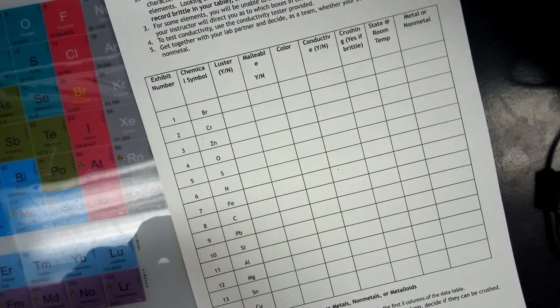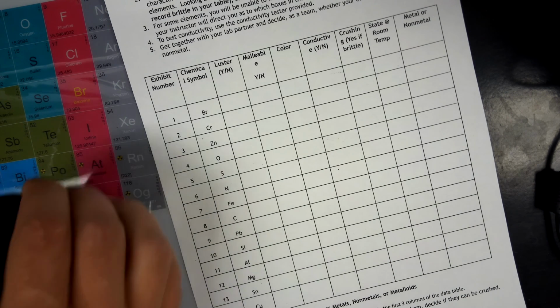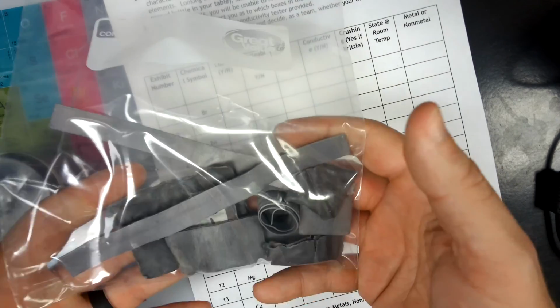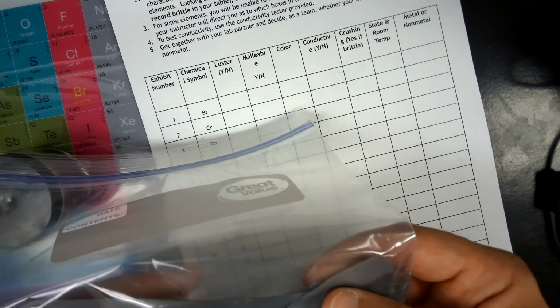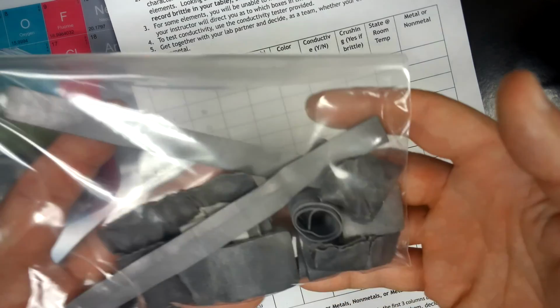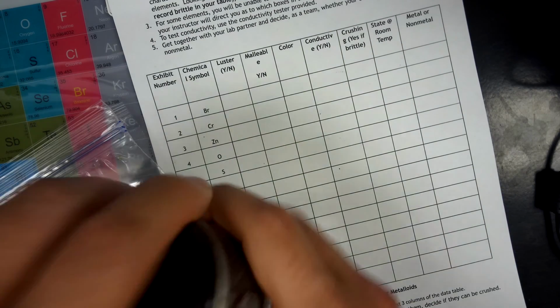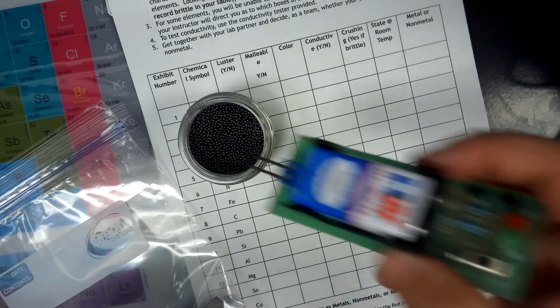One crowd favorite of everyone everywhere, I think, is to play around with some lead. Unfortunately, if you were in class, we're not allowed to play with the lead anymore because the school district does not trust you to not wash your hands or to wash your hands and then not eat it, because if you get it on your hands, you can eat it, and lead is not good if it gets inside of your body. But we got a couple different forms here, and without touching it, I can do the conductivity test.